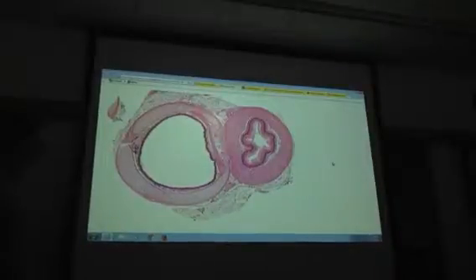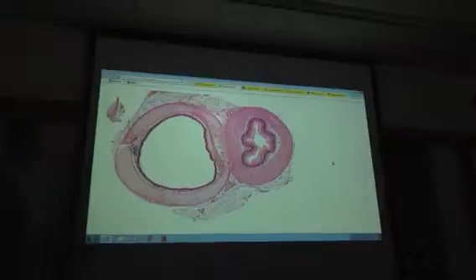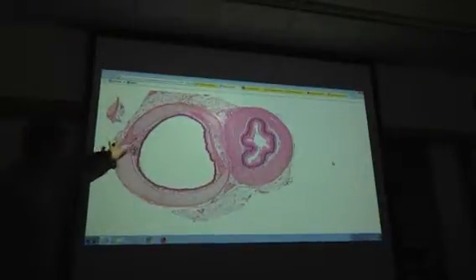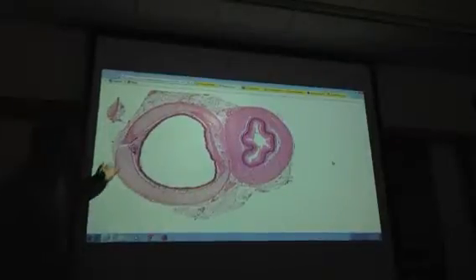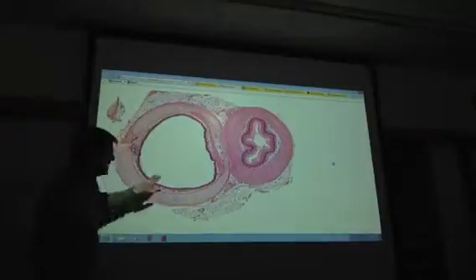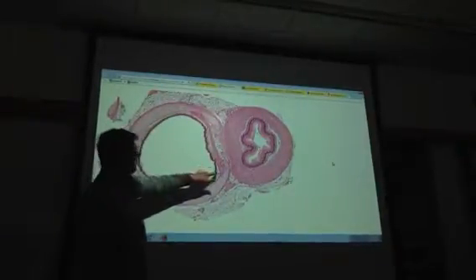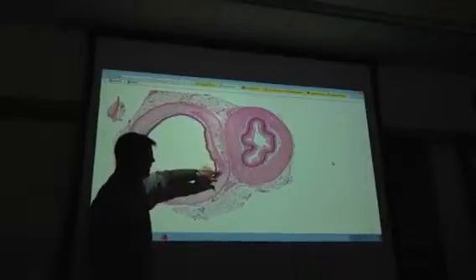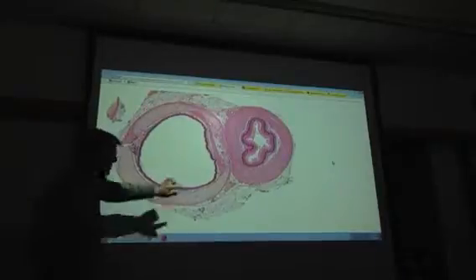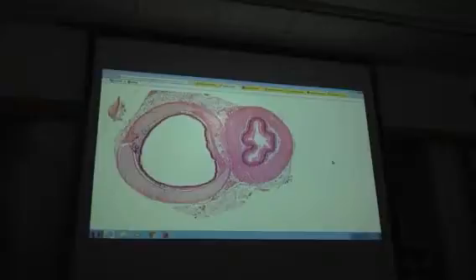I'm not really seeing a lot, to be honest with you. This kind of reminds me of your guys' slide where there weren't a lot of glands in there, but anyway, whatever. What's this here? That's the hyaline cartilage that's coming around, okay? And it's continuous except where you get back to the posterior edge. And there you have this guy. What's that? That's the trachealis muscle that's coming across, okay? So just this little pink thing that's running across here, that's the trachealis muscle.